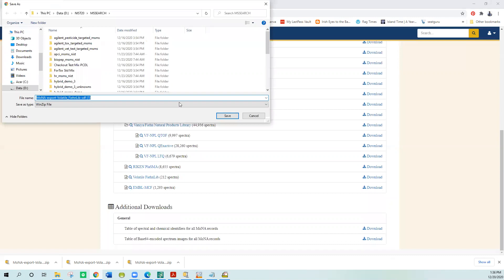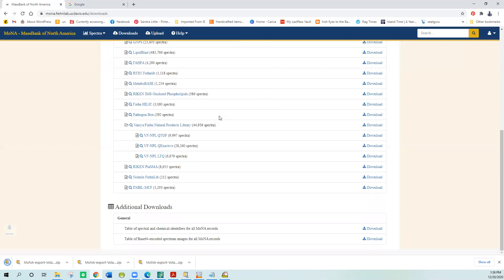I'll download that and just put it wherever you want. It's best to put it in the NIST search folder, NIST 20 MS search. You have to go to that folder and unzip the file because it's actually in a zip folder. You have to unzip it to get the SDF file to show up at that level. I've already done that, so I won't bother doing that in this example.